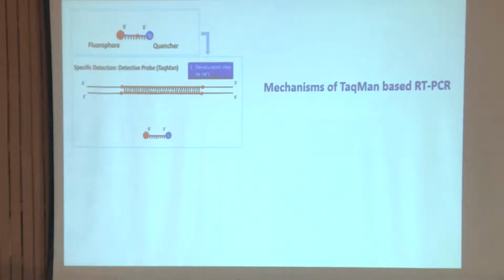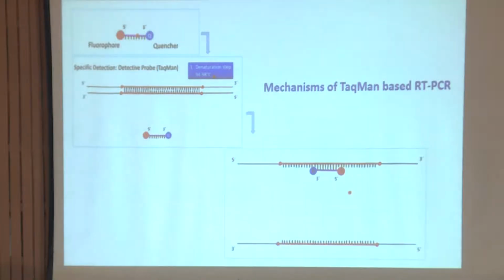Probes and primers will go and bind wherever they have the complementarity. Right? It's a parallel. Remember, it's a parallel event. Okay, it's not one after another. It's a parallel. Okay. Now, what happens? The first step of denaturation, it becomes 2 single stranded DNA. When the 2 single stranded DNA comes there, the action started.